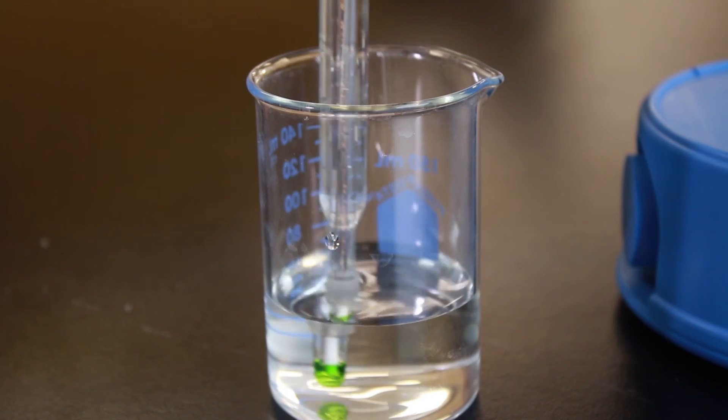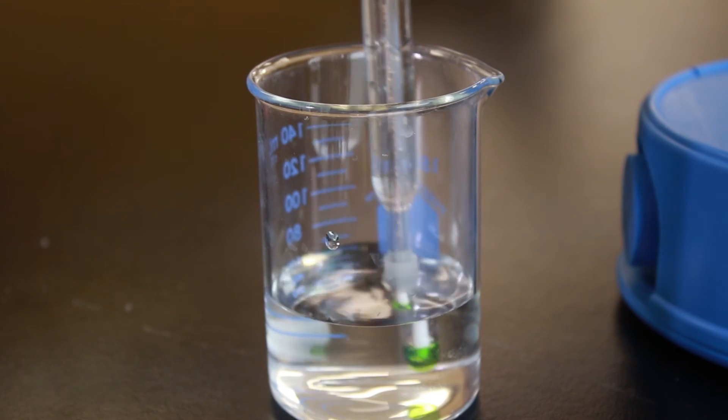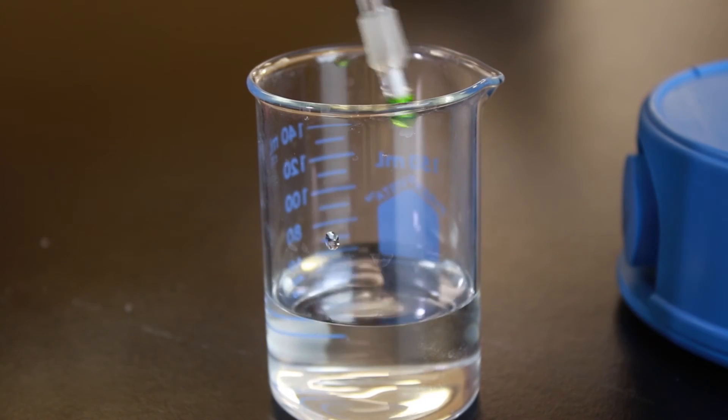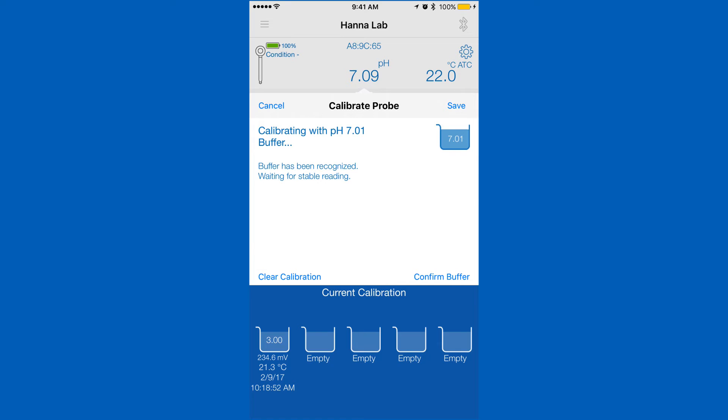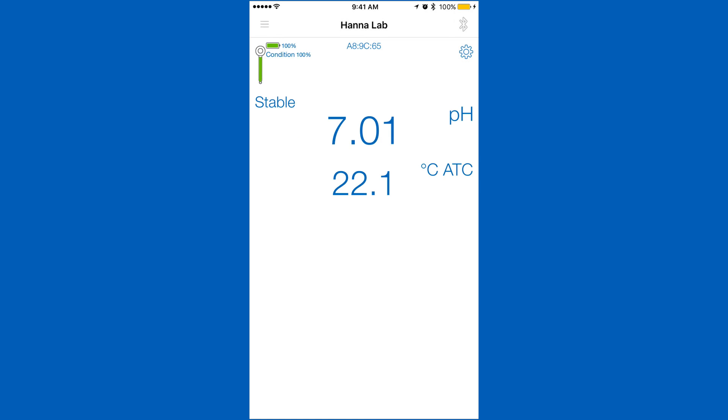To calibrate the next point, we recommend that you rinse your electrode with deionized water to prevent contamination. Place in the next buffer and your saved calibration will be stored, and our app will begin calibrating your next point. After you've calibrated your desired points, hit save to return to the measurement screen.